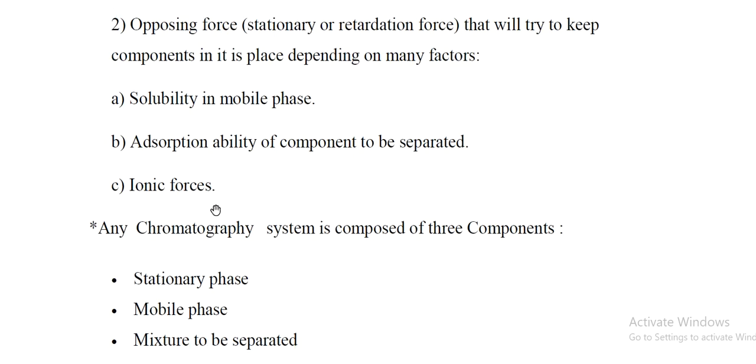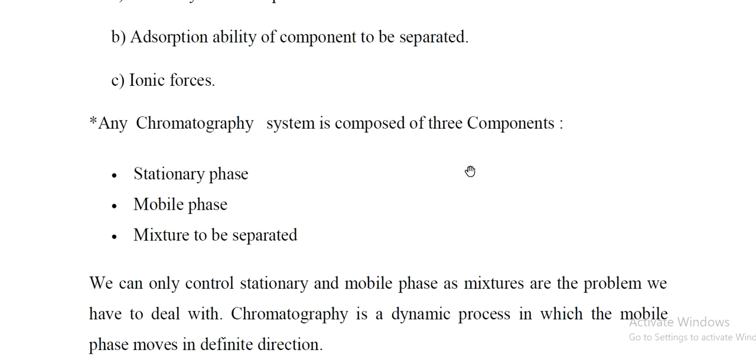تعتمد على ionic forces. Any chromatography system is composed of 3 components.